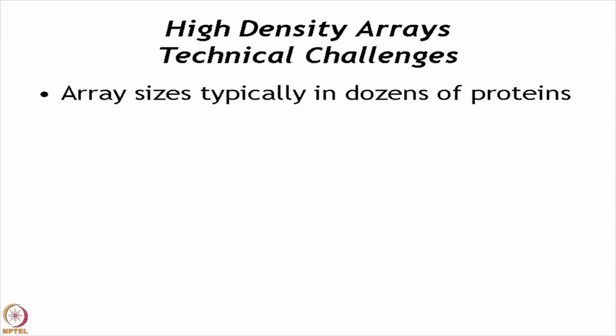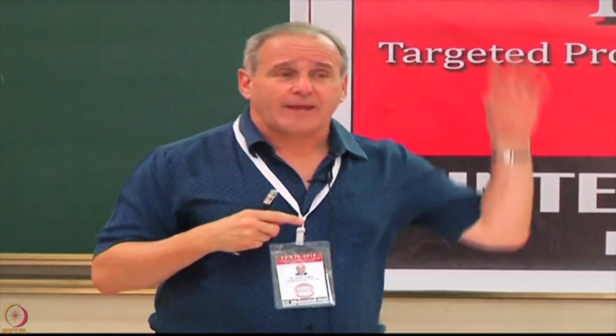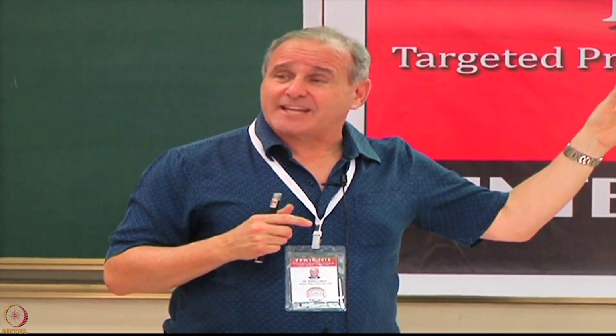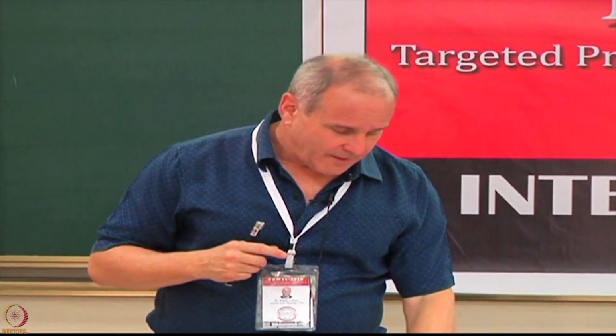OK. So we're going to spend more time later in the course talking about the high-density arrays, but I want to give you a flavor of what we had to do to get now from these arrays, which I showed you had around 50 proteins on them. The goal, of course, I told you from the beginning, was to get to thousands. So how do we adapt a platform to get to thousands?